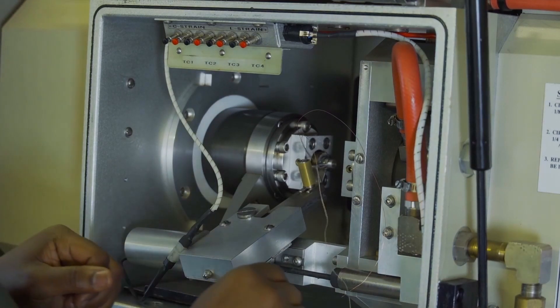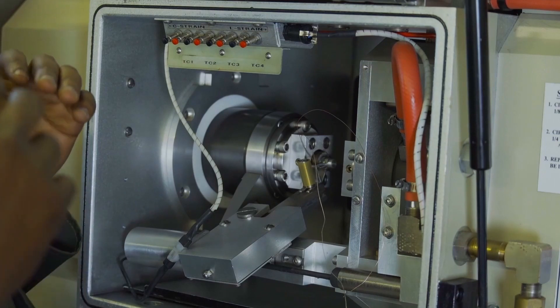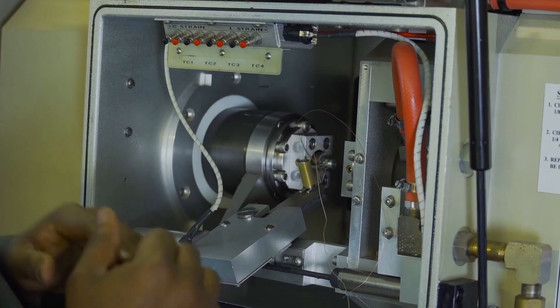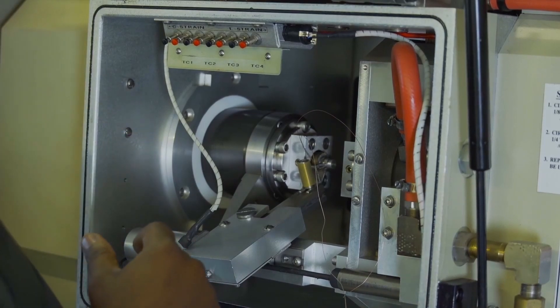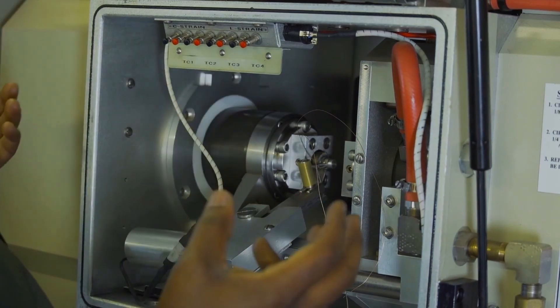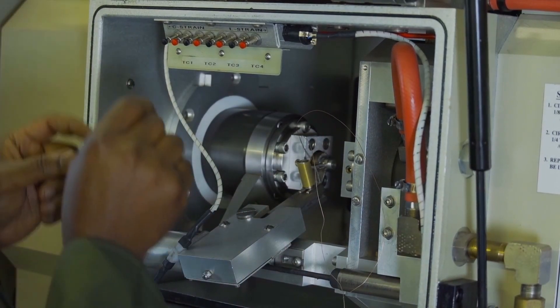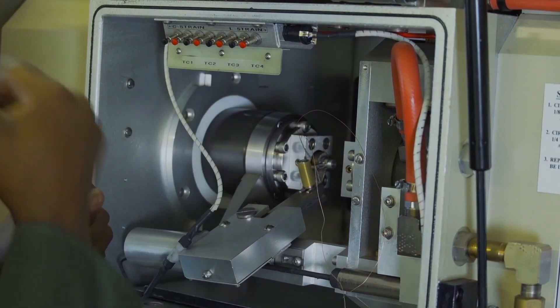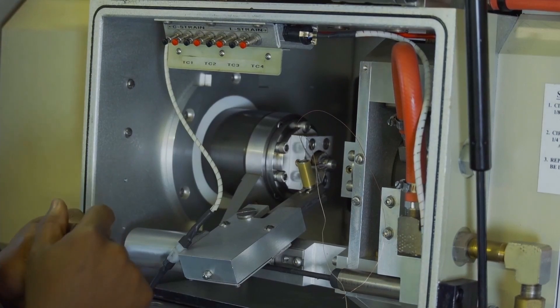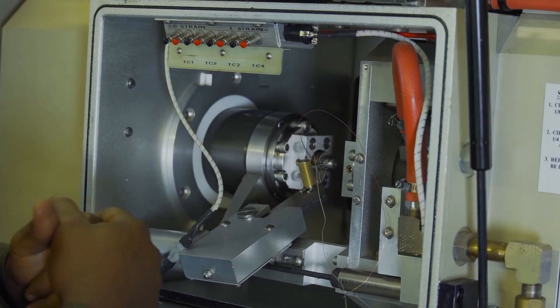What happens is as soon as you run your program on the computer, the computer sends information to the main load unit and it executes the program. At a certain amount of force exerted on the sample, this auto loader would trigger. If it does not trigger, you have to abort the experiment, otherwise you would damage the auto loader.